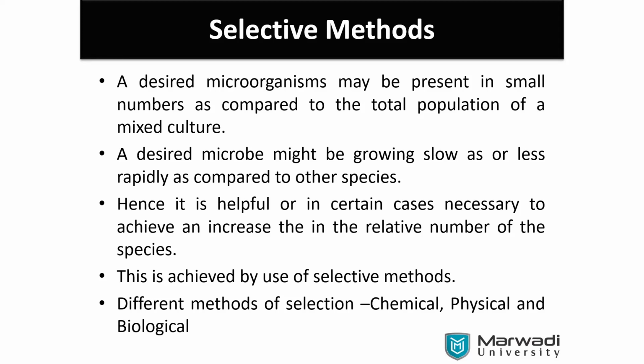That's the one type of bacteria, but here we are planting kinds of bacteria. Yeah, the reason is that maybe while opening it has got contaminated because our plates were good. Yes, we have prepared earlier, right? It was really good. There was nothing, any error.